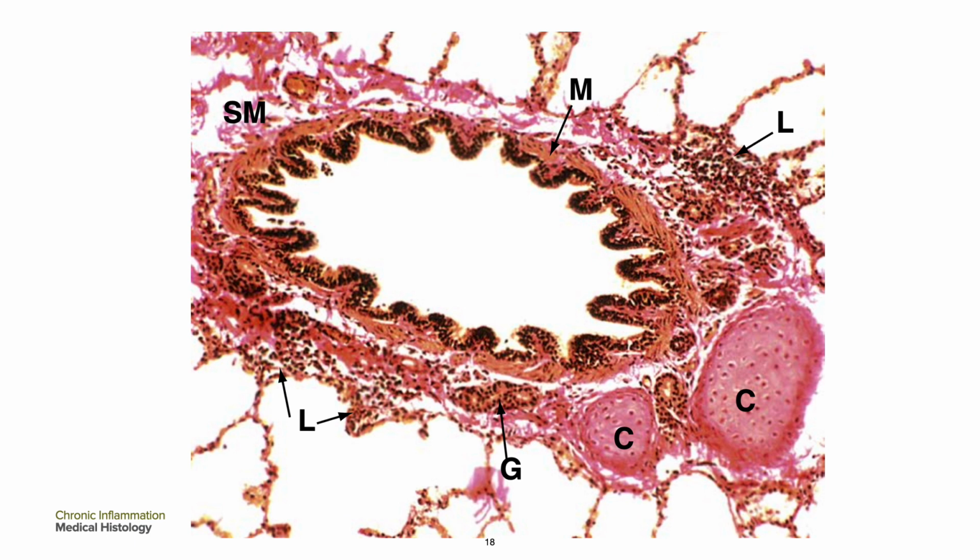This is a tertiary segmental bronchus, elastic van Gieson, in medium power. As bronchi diminish in diameter, the structure progressively changes to resemble more closely that of large bronchioles. The epithelium, just visible in this image, is tall and columnar with little pseudostratification. Goblet cell numbers are greatly diminished.